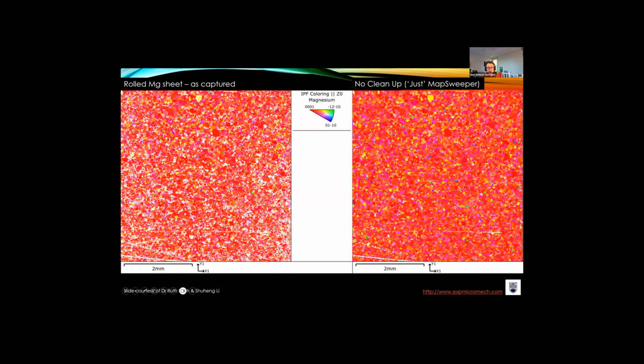So here, I don't care there's a scratch, because the problem I want is to find a yellow grain. I want to find that needle in a haystack of that single grain across this region. That's all I care about. I can put this, if I need to, in the paper or the supplementary. There are worse EBSD maps in the literature, but I can put this in the supplementary if I need to report this fully. But it's, did this help me in that problem?